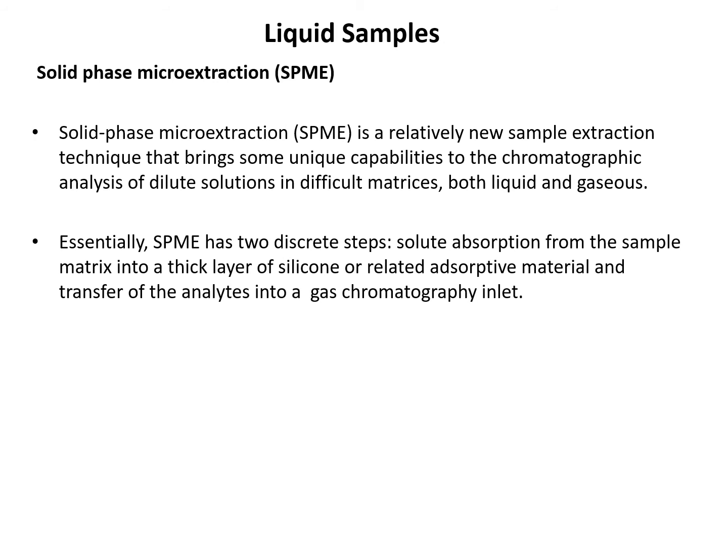So class, now let's move on to solid phase microextraction. Nowadays, people start to move to another technique, which is solid phase microextraction. In solid phase extraction we use a large amount of solvent, while solid phase microextraction is a relatively new sample extraction technique.